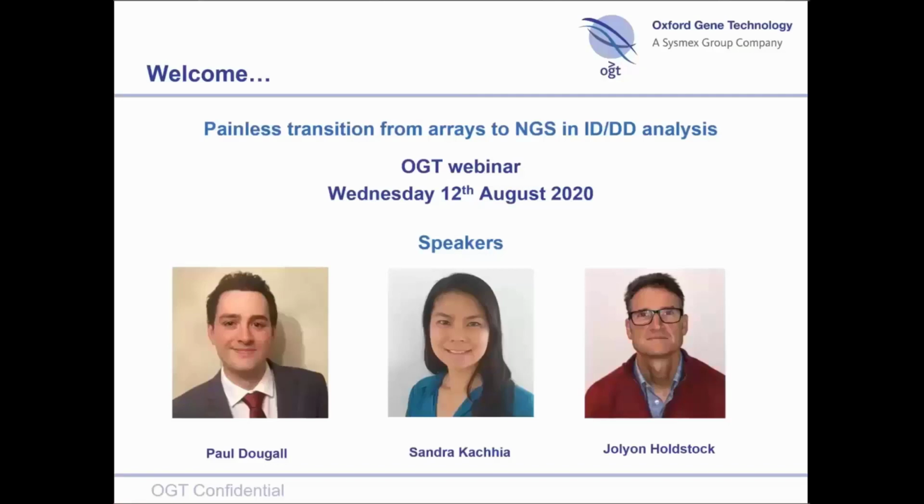Okay. I presume this is for you, Jolyon, as well. What hardware specs do we recommend, and what operating system can it be used on? Currently, the software can run either on Windows or Unix. From a spec basis, we'd say at least 16 gigs of RAM and 8 CPU cores. But I would say anything more than that is a bonus.